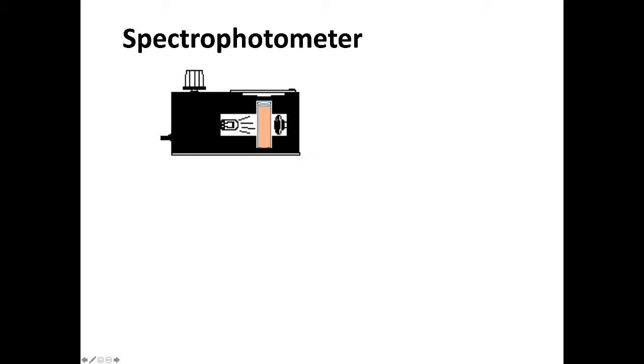That light is a complementary color to the orange. The reason this solution appears reddish-orange is because its complementary color, blue, is absorbed. So pay attention to the specific wavelength used. We use a wavelength of light where there's a high absorbance in that solution.